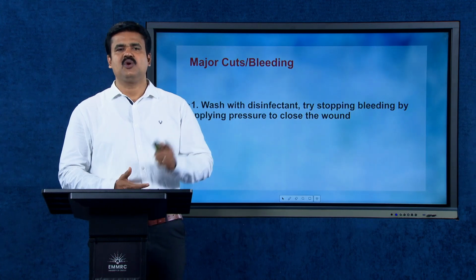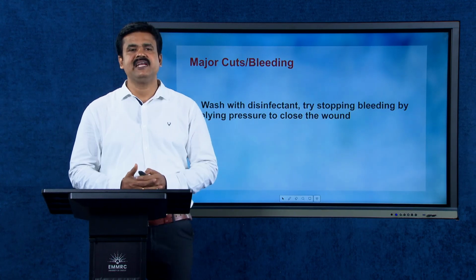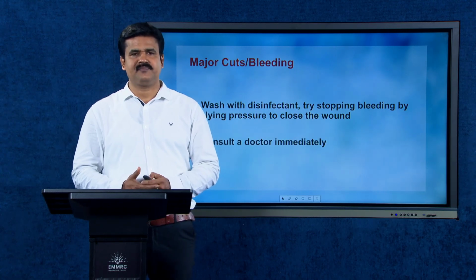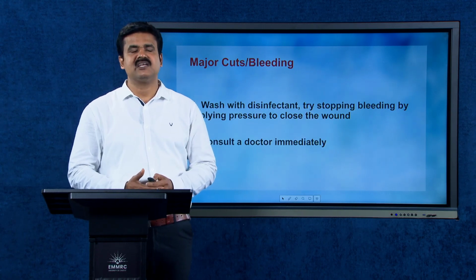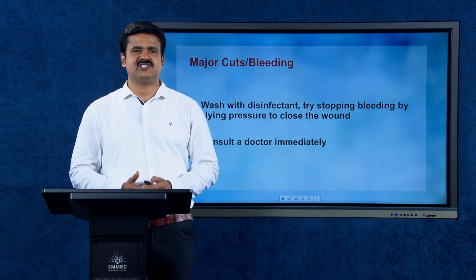Now the first aid for major cuts and bleeding. First of all, you have to wash with disinfectant. Try stopping bleeding by applying pressure to close the wound. Consult a doctor immediately. That is the immediate stage.